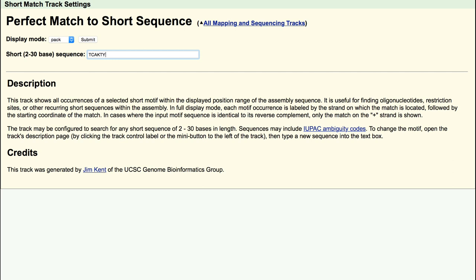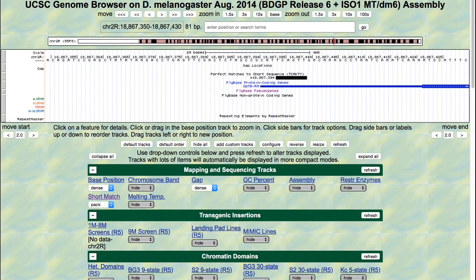Note that TCAKTY is the consensus sequence for the INR in Drosophila. K represents keto, either guanine or thymine, and Y represents pyrimidine, either cytosine or thymine. After changing the display mode and typing in the consensus sequence, click Submit.